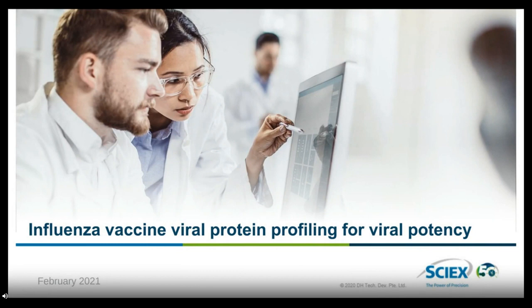Hello everyone, and thank you for that kind introduction. Today we'll be talking about a method to profile viral proteins in influenza vaccines for viral potency.